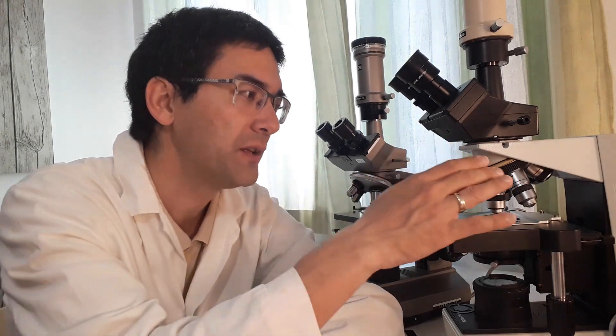Now it is like this that phase contrast allows you indeed to see transparent specimens more easily. Bacteria can also be observed—this is not a phase contrast, it's a regular bright field microscope. Bacteria can also be observed with regular bright field. All you have to do is close the condenser a lot, and then you can see them. You see more of a diffraction pattern, but you can still see them.